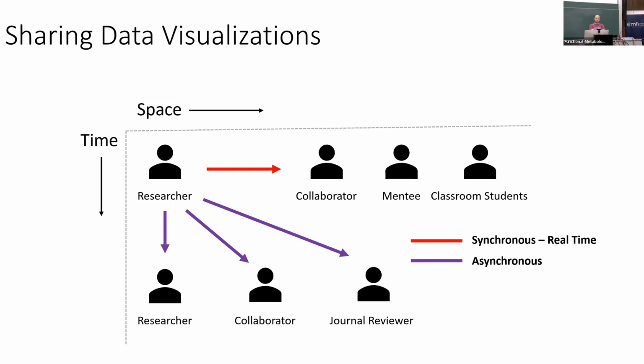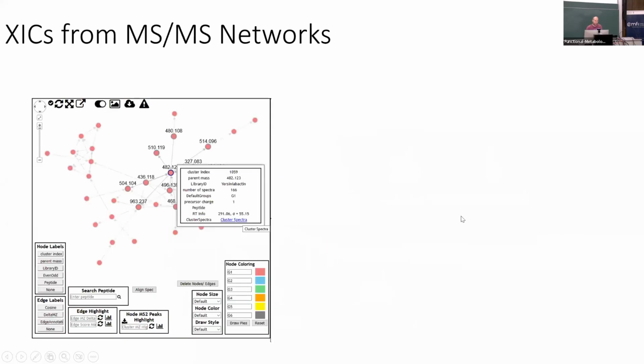And then there's synchronous and asynchronous visualization. I can generate these real-time links for a particular session and then share this with all of you. And then, as we go through, you should see the same stuff I do. For long-term, obviously, you want to have the asynchronous. So this is just the static view.